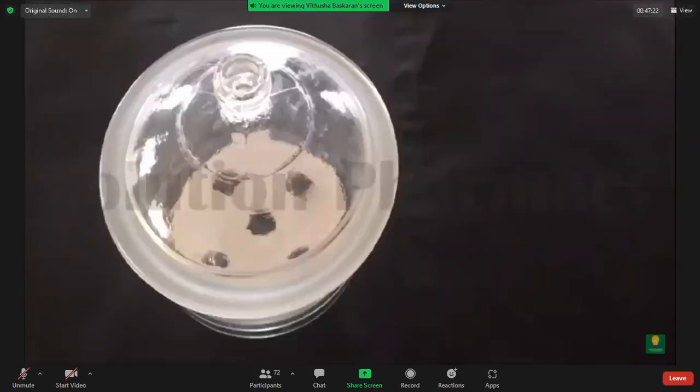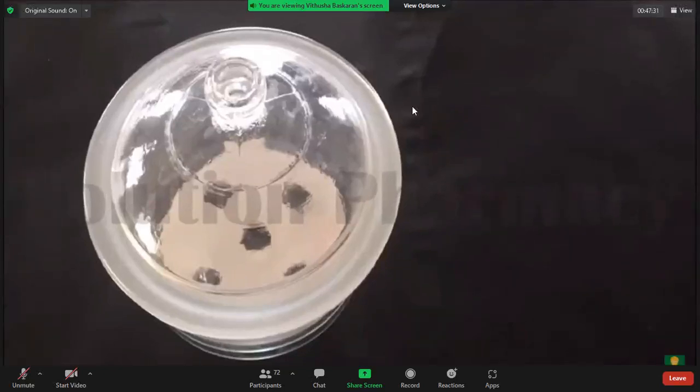Hello friends, welcome to the channel Solution. Today in this video we will show you the standard operating procedure of desiccator, means how to use desiccator in proper way. First of all, let's know what is desiccator and how it works.